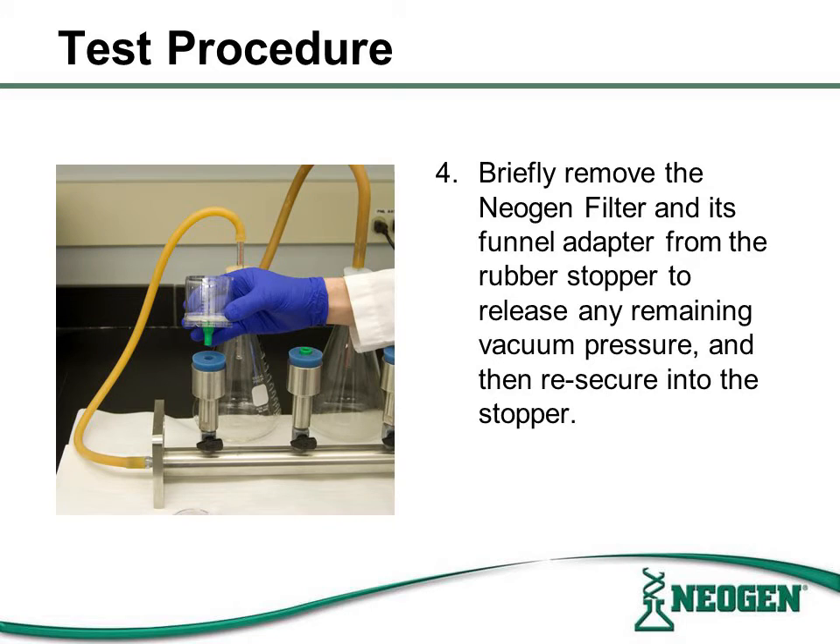Once the vacuum is turned off, briefly remove the Neogen filter from the funnel adapter to release any remaining vacuum pressure. Then re-secure the Neogen filter onto the funnel adapter.